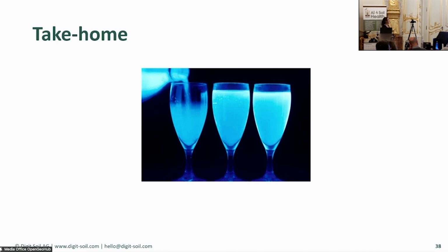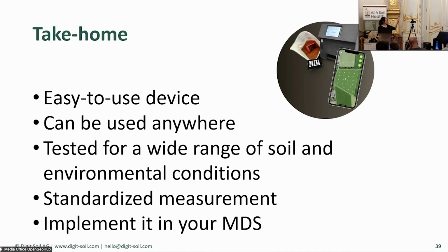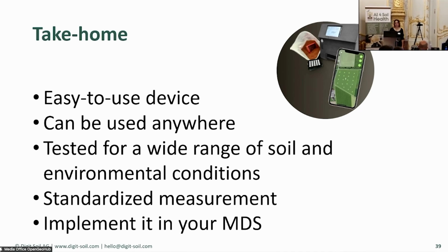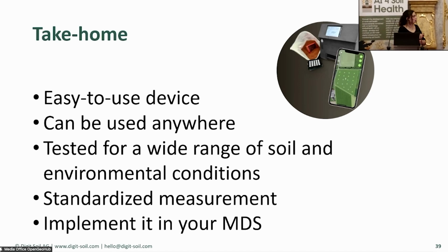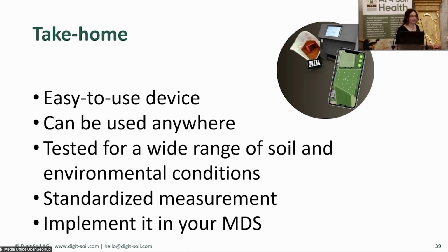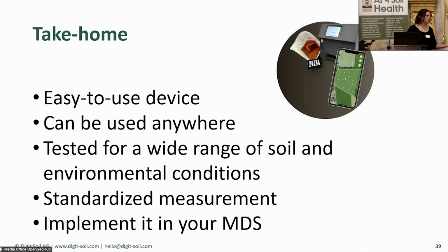But what I really want you to take home is that we have this device that's pretty easy to use. It can be used anywhere, and we tested it for a wide range of soils and environmental conditions in a very standardized way. And maybe this makes it suitable for using it more to have a better temporal and spatial distribution as a biological soil indicator.